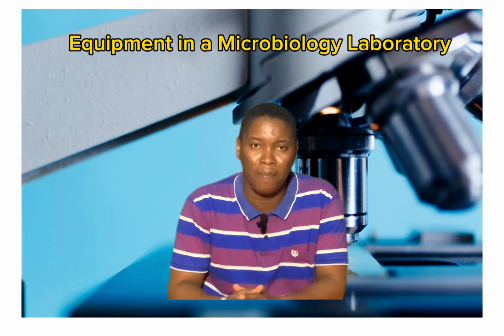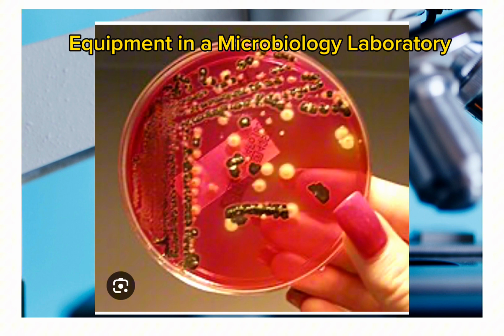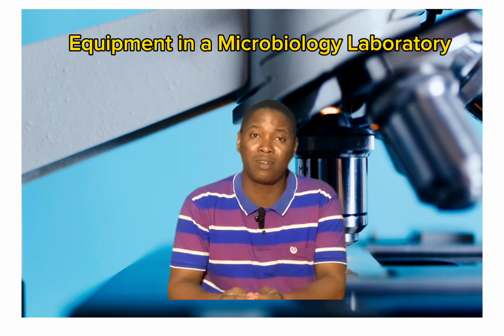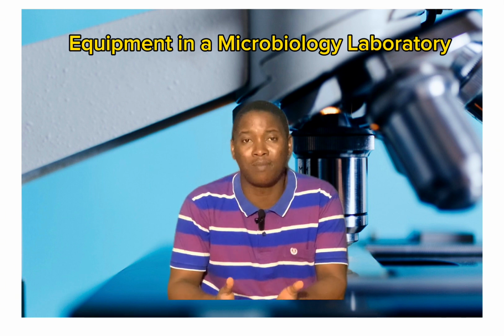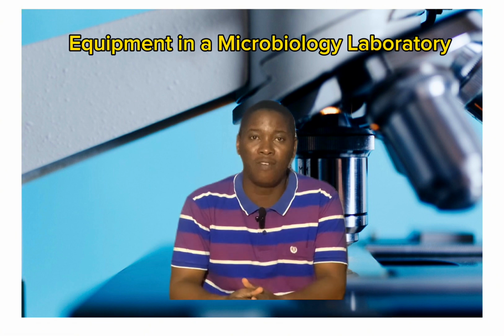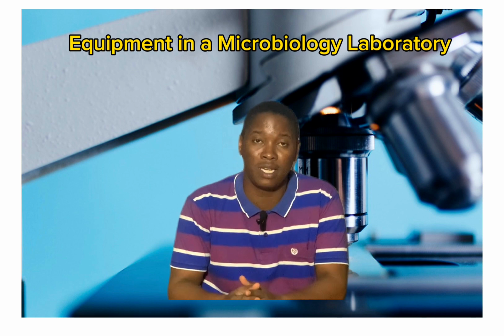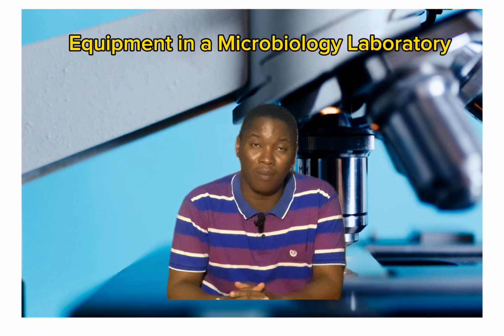We also have growth media. What is growth media? Growth media is a preparation which can be semi-solid, and if it's semi-solid, we refer to it as agar, or it could be liquid, and we refer to the liquid as broth. So any preparation that supports the growth of microorganisms, especially bacteria, we refer to as growth media. All these media are used to encourage the growth of microorganisms, and this is quite important to know. There are many different types of culture media.